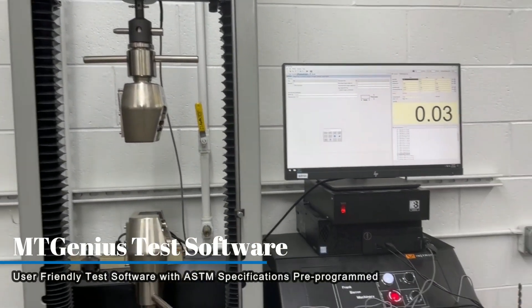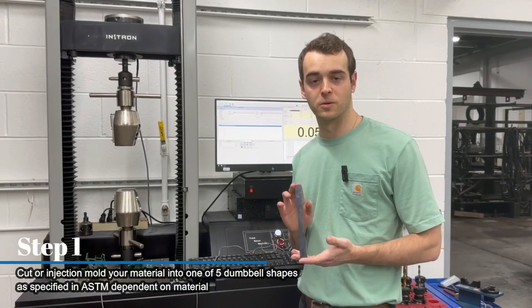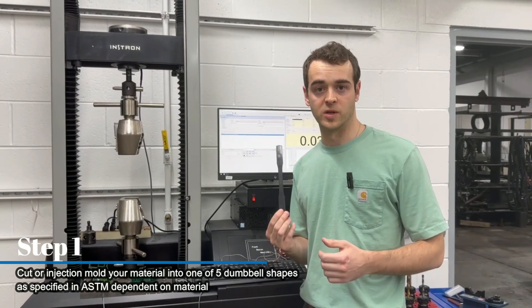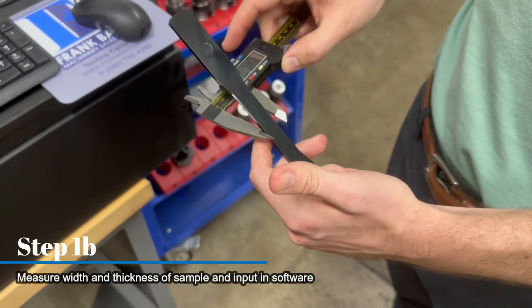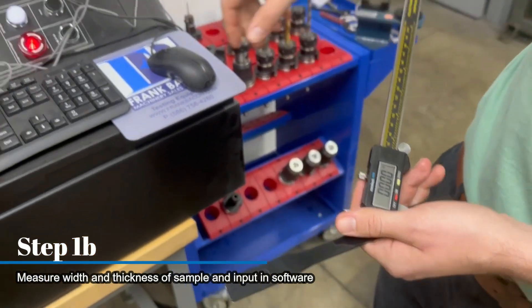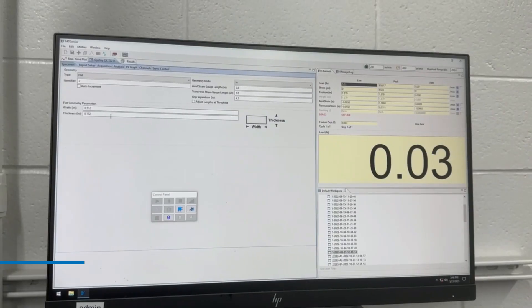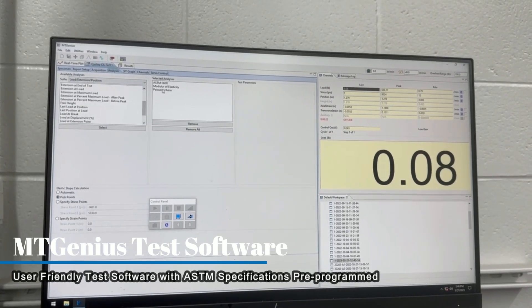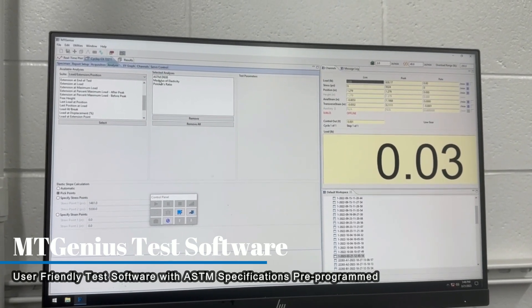And of course we've got MT Genius software here. The first step within this test is having a properly machined dog bone sample, which is going to be determined by your material and called out within the ASTM. We'll take a measurement of our width and thickness and enter that into our MT Genius software. We've got our specimen geometry input, and under our analyses we've got ASTM D638 — one of the ASTMs already preloaded into the software.